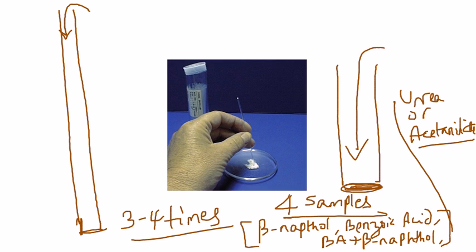Realize that with a fast reading, the heating block in which you inserted your sample is heating at a very fast pace, because of which it's non-uniform, and usually the readings you get are higher than the real literature value.